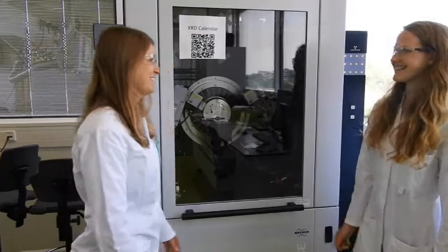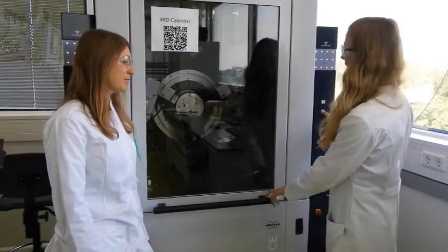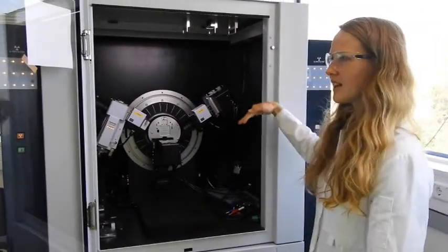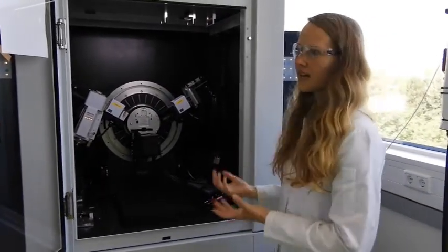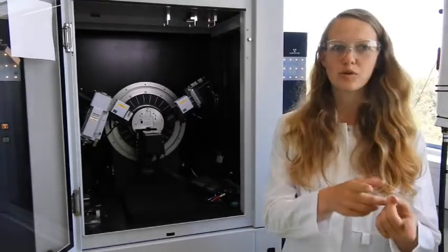Hey Cordula, hi! So far we have talked a lot about powders, but you're working with quite different materials. Yes, I'm working with thin films, and thin films can be analyzed with very different techniques. So one, for example, is the GI-XRD technique. So we have here two different arms which can rotate into an angle and then analyze the thin film surface of the material. On the other hand, if you don't want to have only the crystallinity of the surface, we can also do GI-ATR. Then we go over there.